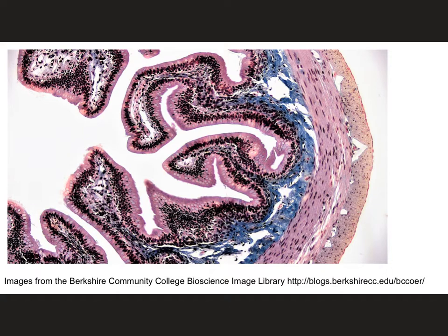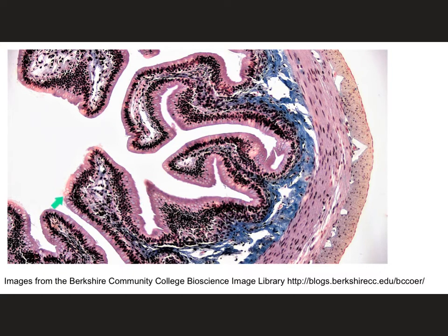This structure has a lot more to examine. You can see that it is a many-layered structure with an internal section — an external portion, then some other layers, and then more cells all the way on the inside. Some of these look very different from cells we've seen previously. There are lots of little dots in some sections but not a lot of distinct cells, and then the internal portion seems to be lined. Since we know epithelial cells line things, I would expect to find a layer of epithelial cells around something — and in this case, what you're looking at are the villi of the intestines.